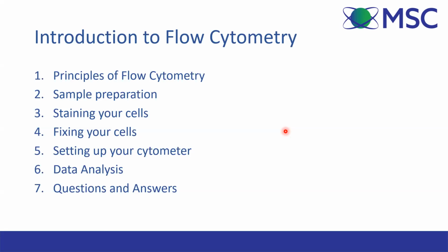From my 7 years of flow cytometry experience, if I was to impart one piece of advice, it would be to standardize your protocols at the beginning of your project. For your sample prep, staining, and analysis, standardize everything, optimize it all. Then you get the best quality data out at the end, and you actually save time by not having to repeat experiments.